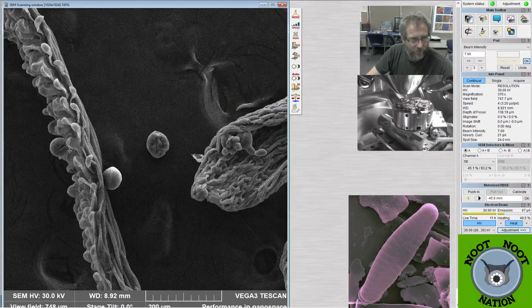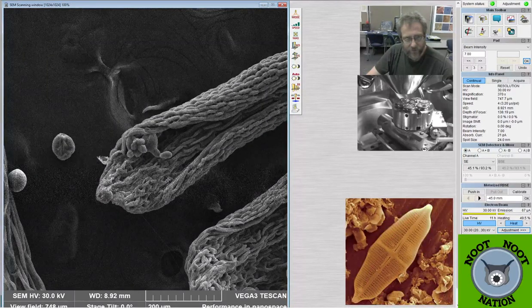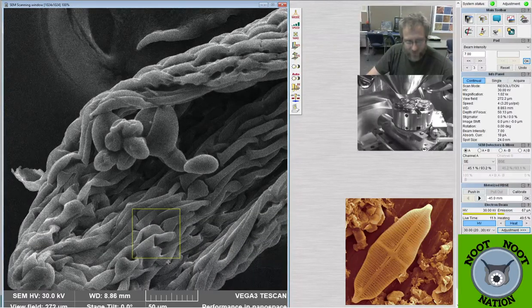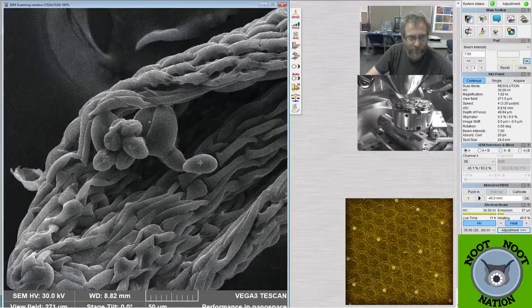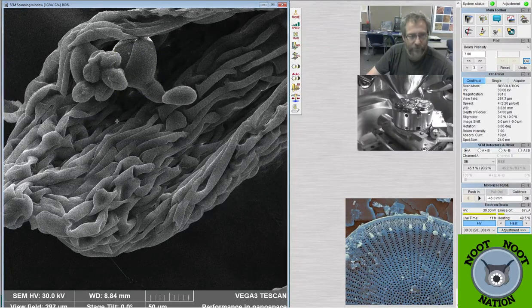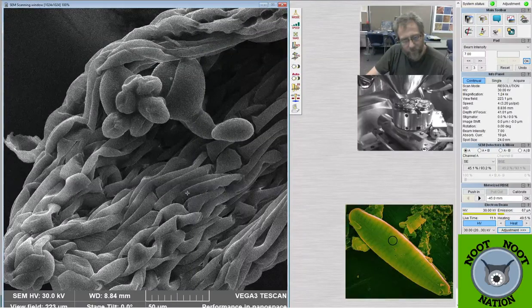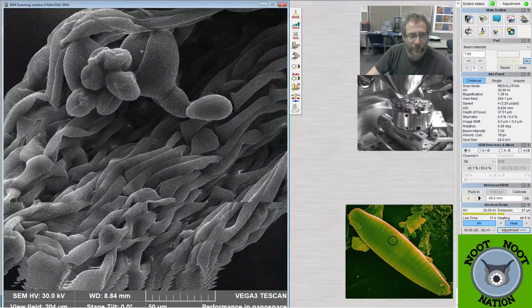You can see they're here as well. And some of the plant material looks practically braided. They're really kind of a cool look to the structure of the plant cells. Here you can see there's a cluster of them together wrapped up in the plant, still producing them, or it was before I killed it. There we go. That looks nice and sharp.